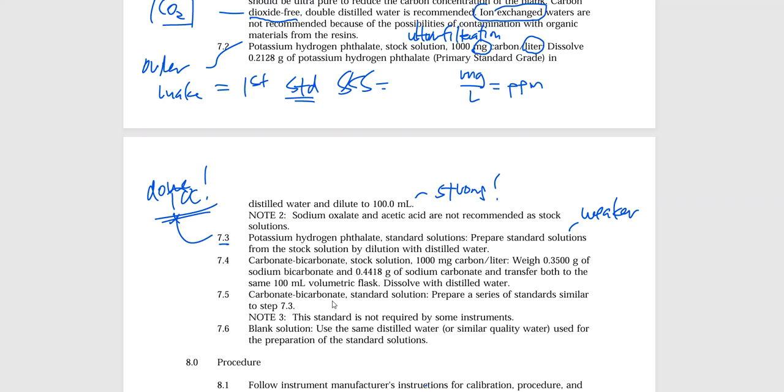And you're going to see that take place in our laboratory by the time that we get there. So this is going to be more than a one-day event. And on the second day is typically the day that I show you the instrument. How does it work? What's going to go on? And then I'm going to walk you through the steps of how to enter your information into the batch, and I'm going to show you the steps of how to get the machine to make the standards for you. So very, very important. That's what we're going to do.